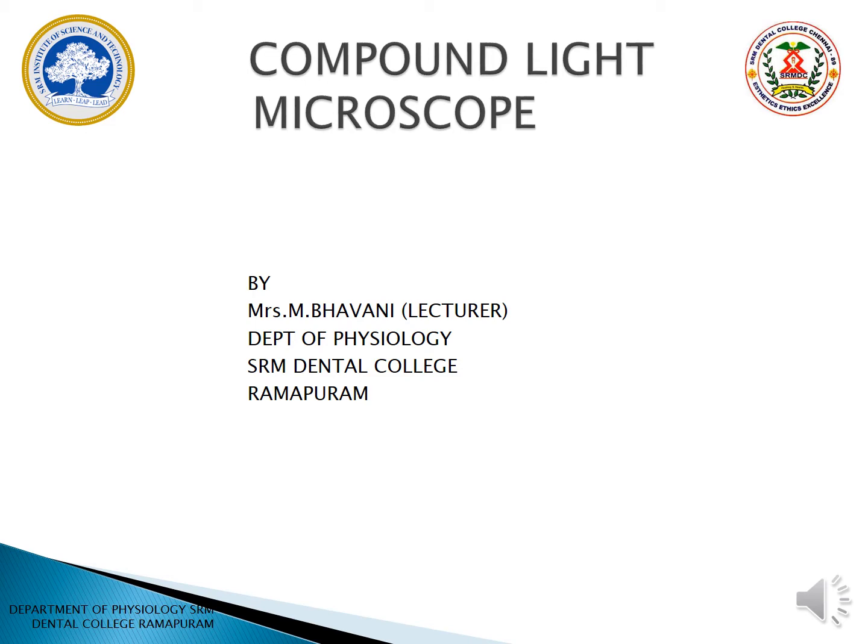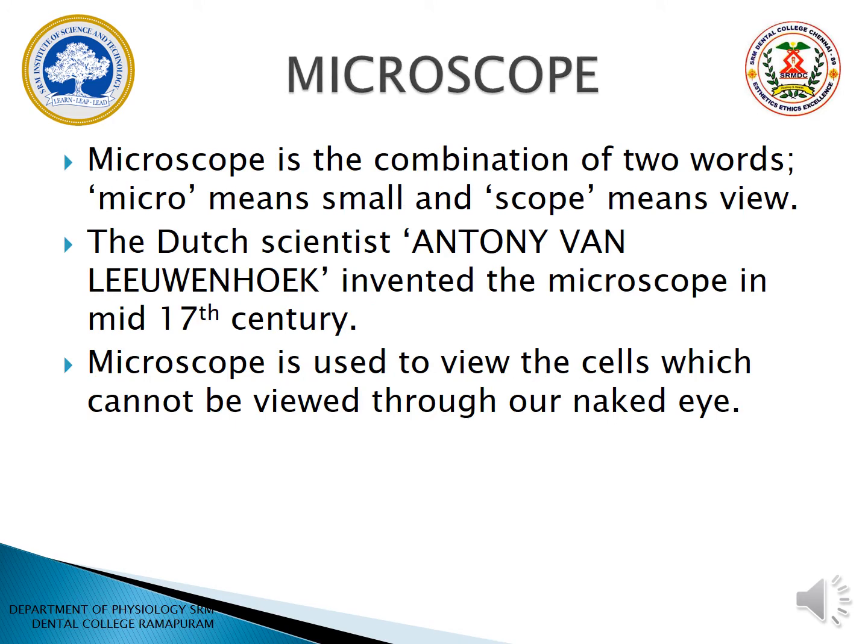So today I am going to teach about compound light microscope. First, we can know about what a microscope is. Why are we going to use a microscope, and why is a microscope needed for us? From the meaning itself, micro means small and scope means view.